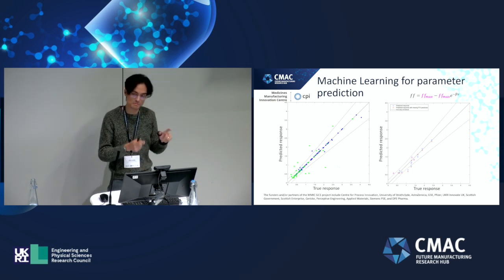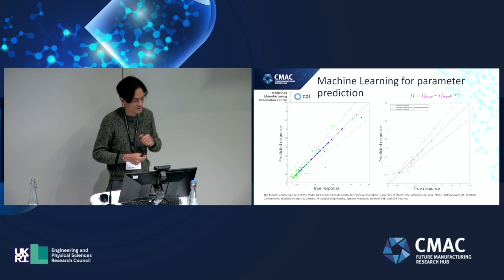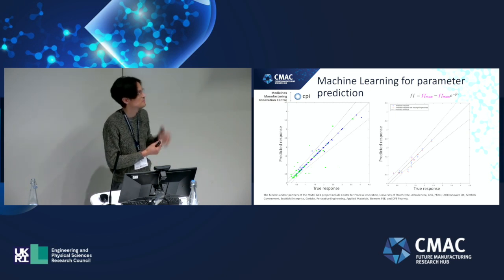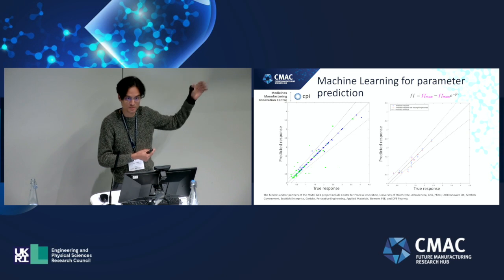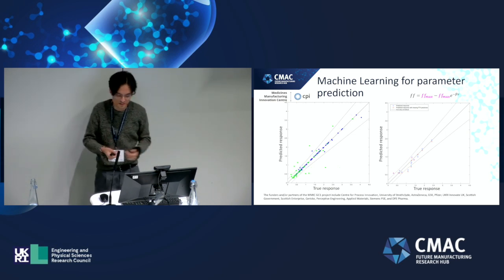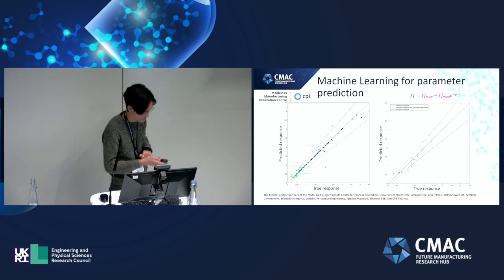And in some cases, there was a degree of variability in these, even though ostensibly it's the same material in the same feeder with the same equipment. Now, if you've got results that are substantially different for what should be the same thing, a machine learning model can struggle with that sometimes. So we've taken the average for these replicates to use in the training, although they were weighted by how many data points we originally had. So that's the explanation of the faint and solid data points.